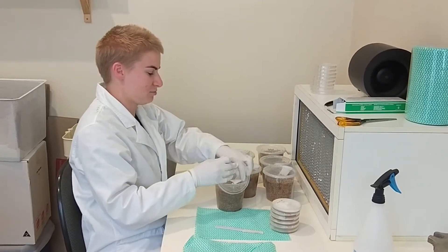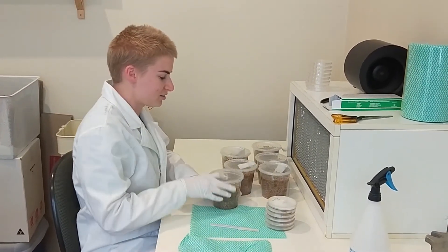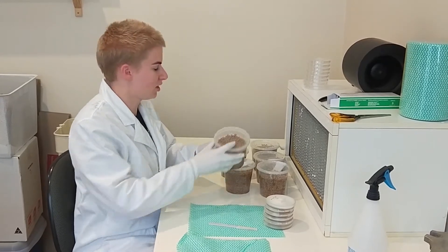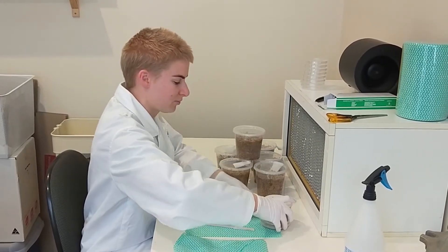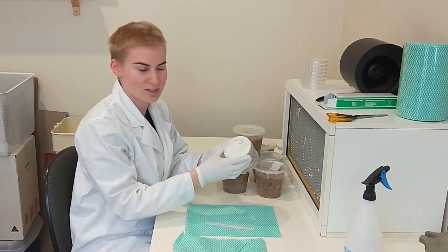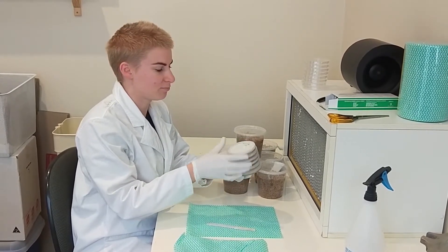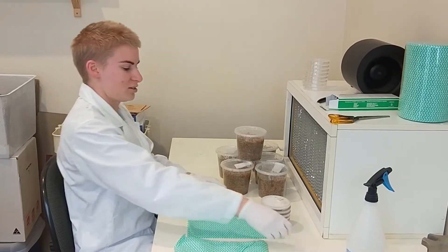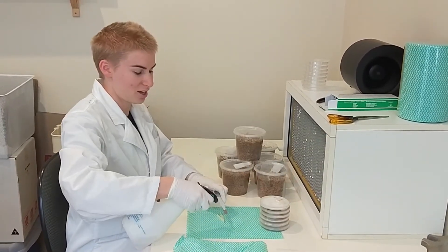We're just doing a grain transfer this morning. This is some sterilized wheat grain which we've just pulled out of the pressure cooker. We've got some petri dish cultures of Phoenix oyster, which is Pleurotus pulmonarius. It's super healthy and ready to move on to its next substrate, so we're going to help it do that today.